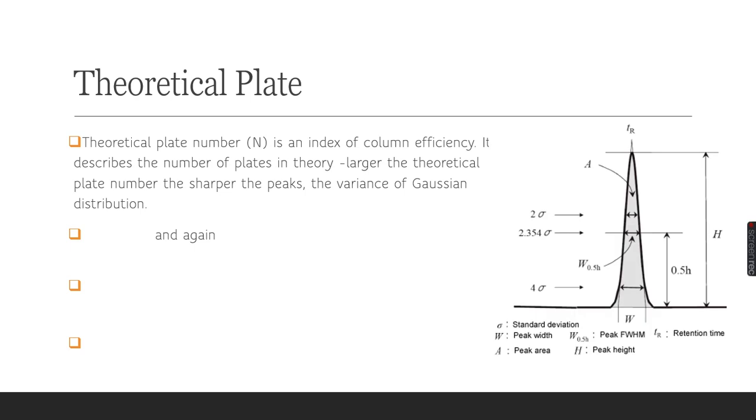Now we will be discussing something on the theoretical plate. You need to understand that the theoretical plate concept is coming from a column, because you can assume the whole column as an array, a series of small segments which are interacting with one another in a continuous manner, like we have seen in the case of liquid extraction process. The same procedure you can assume here as solid liquid extraction, but in a constant manner, with constant flow of the liquid carrying your compound. So essentially we can assume that each of the segments is a plate.